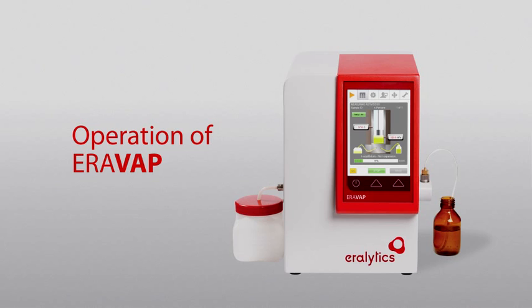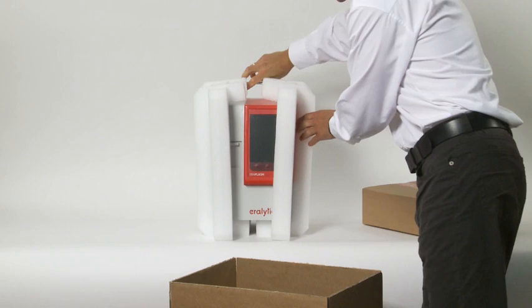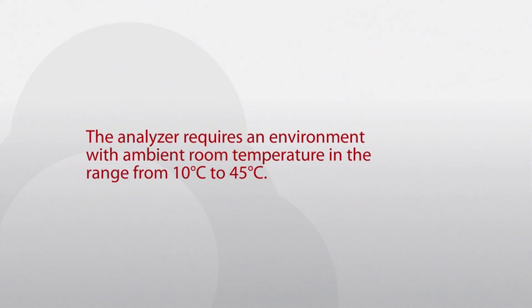Operation of Eravap. Setup. After unpacking, place the instrument on a stable bench top. Make sure that the vent holes of the analyzer are not obstructed.